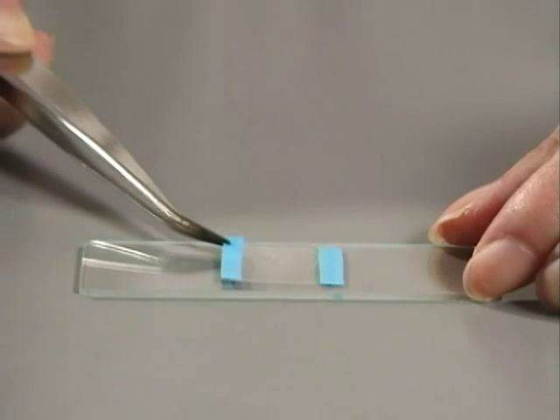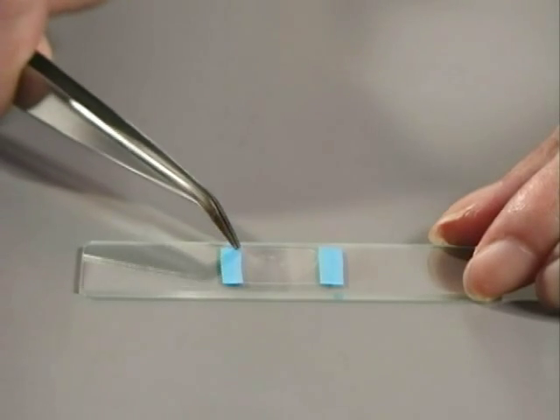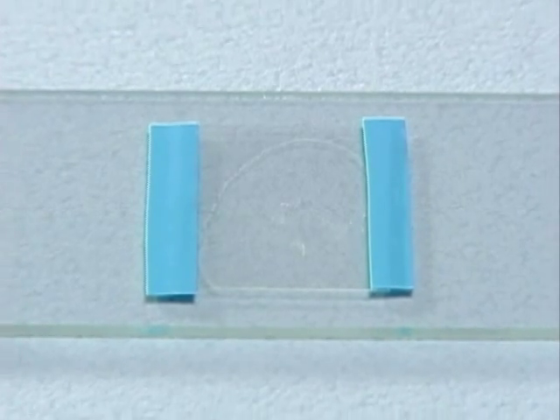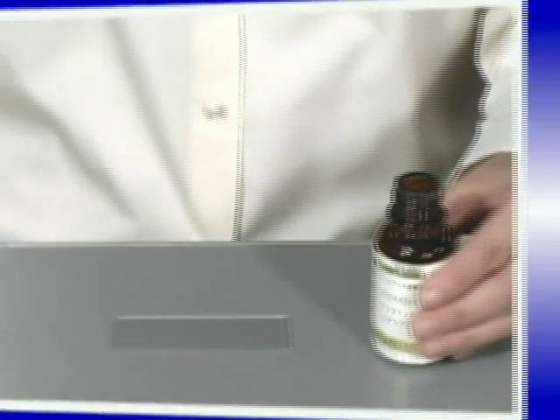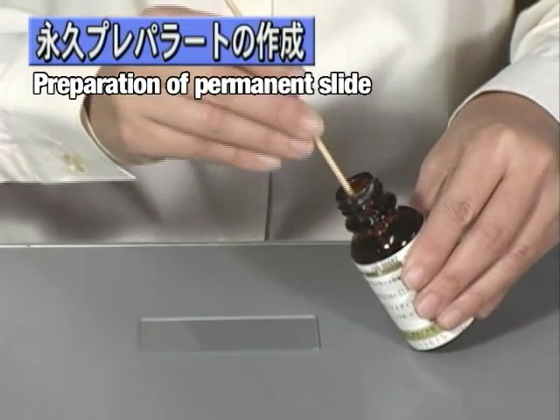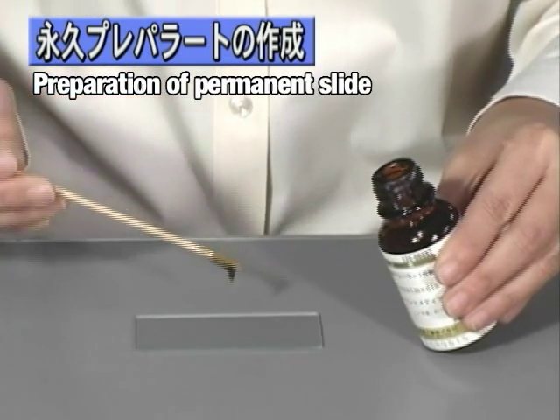Once tape is placed to set the cover slip on the slide, preparation of the slide is complete. This method of slide preparation creates temporary slides. There is also another way to prepare slides that produces permanent slides. First, about one drop of plurax mounting medium is placed on the slide.